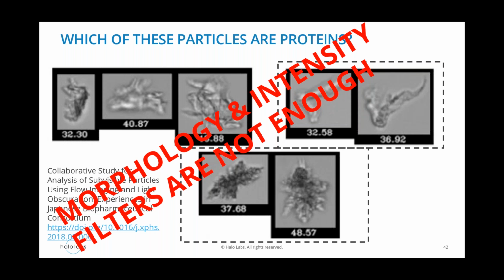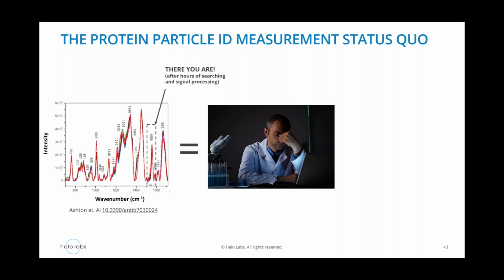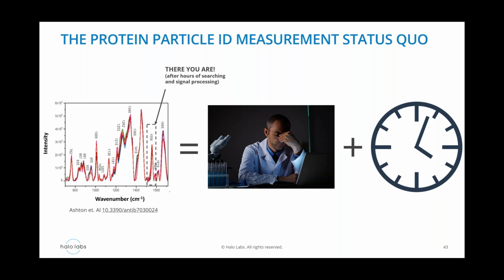indistinguishable. You can't just use the fact that some are lighter or brighter, or their morphology, to identify them, because it's simply not enough. Flow imagers are very powerful tools, but for full ID, they're essentially just a surrogate and a helper for characterizing these particles. At the opposite end of the spectrum, you have these low throughput Raman detection systems that are used very much forensically. Once you've spent years optimizing something, but it broke, and you have to figure out what's going on, that's an incredibly arduous, expensive, laborious, and highly expert process. Unfortunately, it takes forever, and it's not really intuitive.